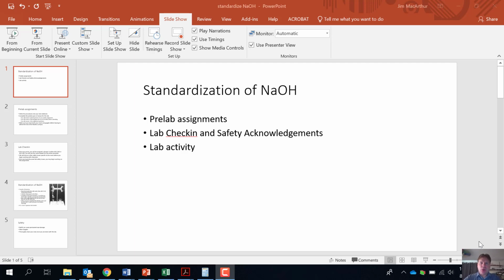Hello everyone. We're going to talk about the standardization of sodium hydroxide lab today. And I wanted to talk about a few things. You'll be doing a pre-lab assignment. Because it's our first in-person lab, you'll be doing a lab check-in and safety acknowledgements. And then we'll go ahead and talk about the lab activity itself.